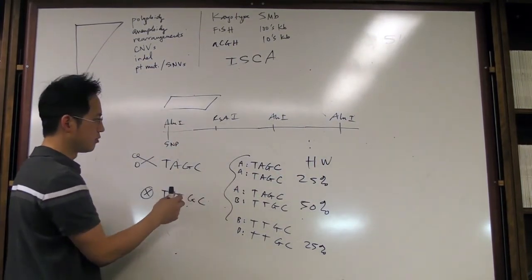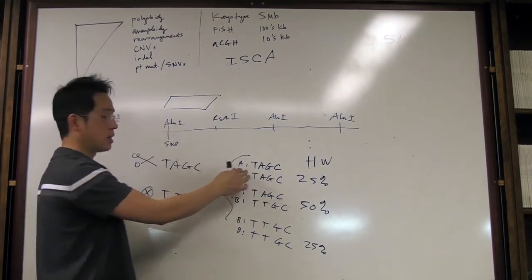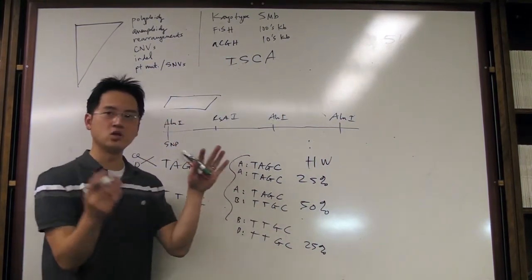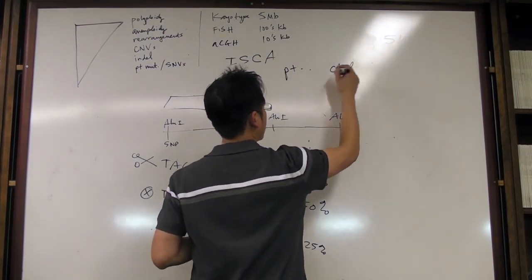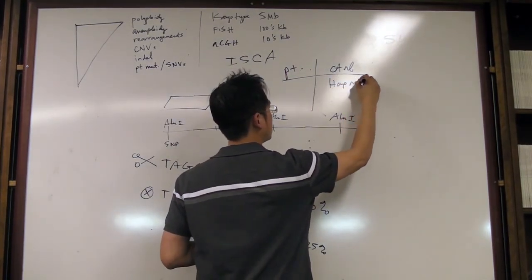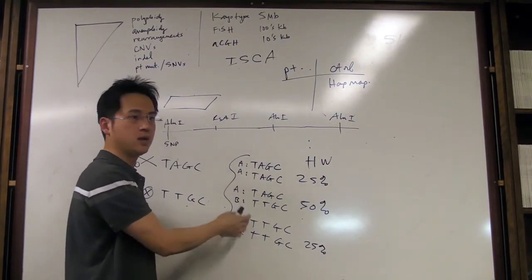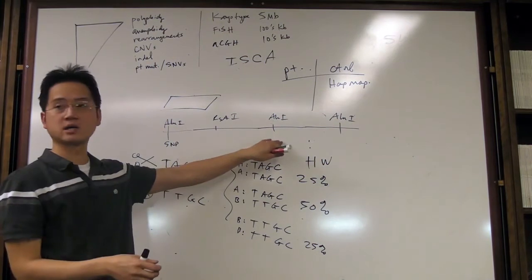But here you can see, for example, in this state right here, both of these alleles will get cut, right, in the patient. And only one of the alleles here will get cut. No alleles here will get cut. So what happens is that your control sample. Here's the patient, here's the control. And the sample that we need to use is some HapMap sample that we know the genotype already of. So we know what that patient is at this one locus. We know that they are either AA or BB or AB. We know that for every 60,000 of those SNPs that we designed this assay for.